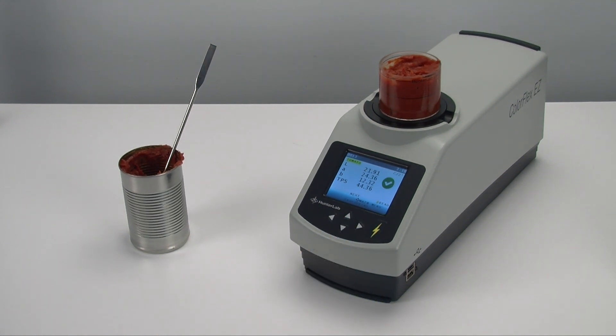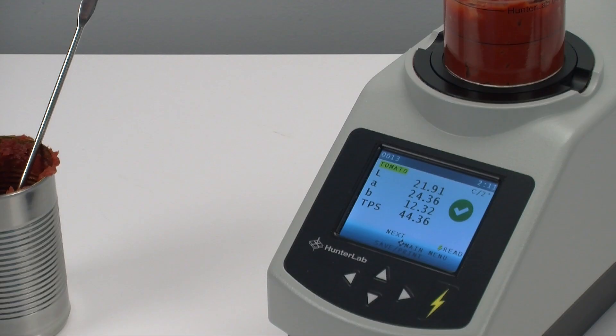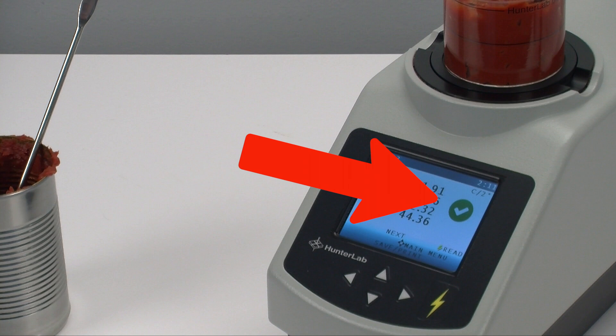Press Read to measure your sample. In less than four seconds, you'll see the initial view with tomato paste measurement values — LAB and TPS, or tomato paste score. As well, there is a visual pass or fail mark indicating whether or not that sample is within the established acceptable color range your company has set, further simplifying the task of evaluating your tomato product.